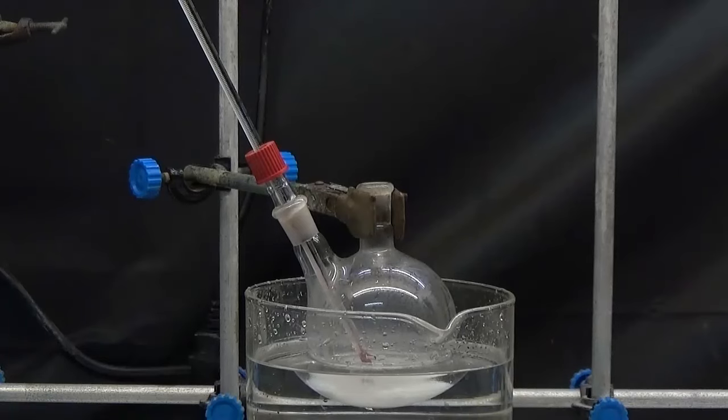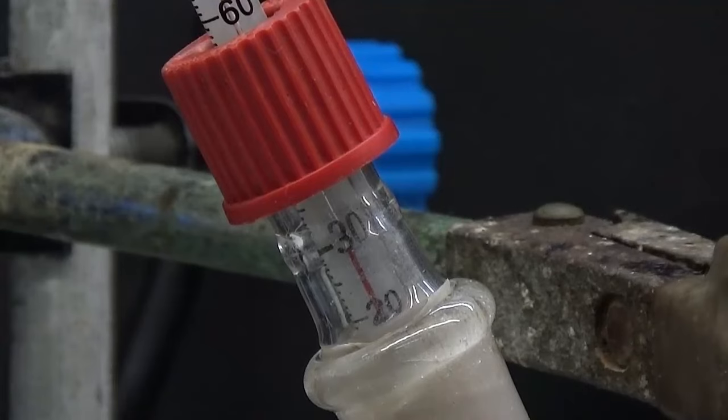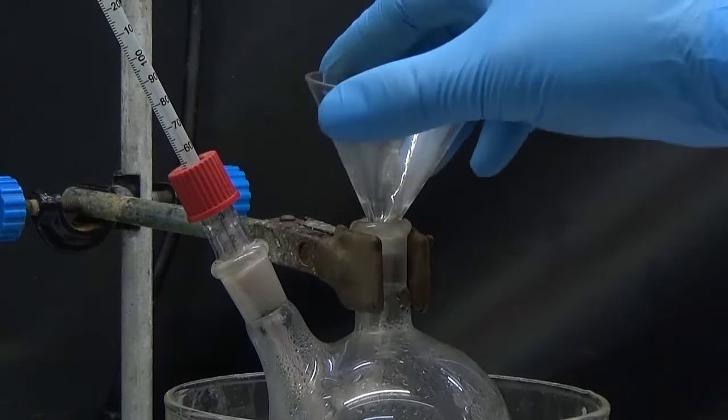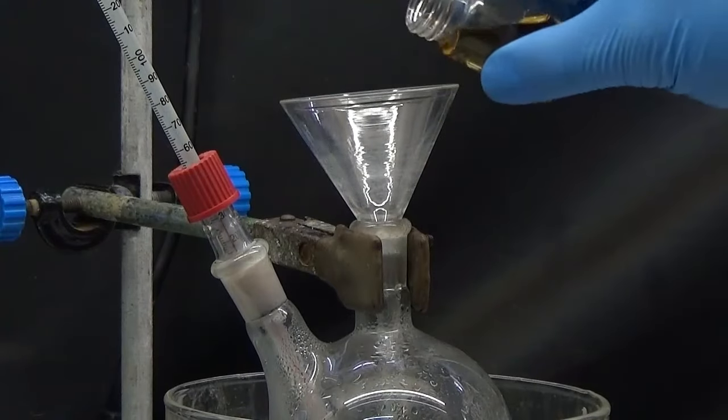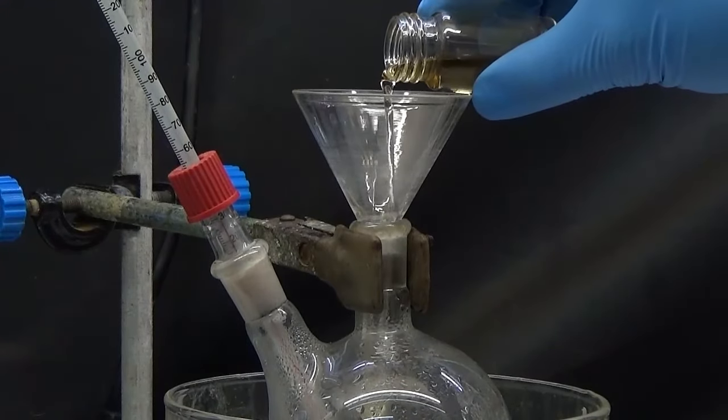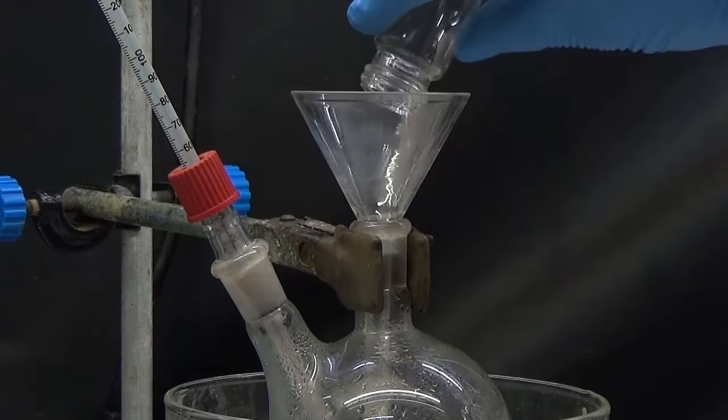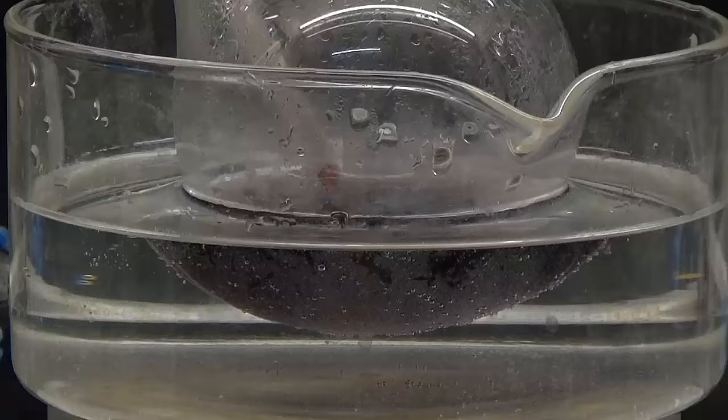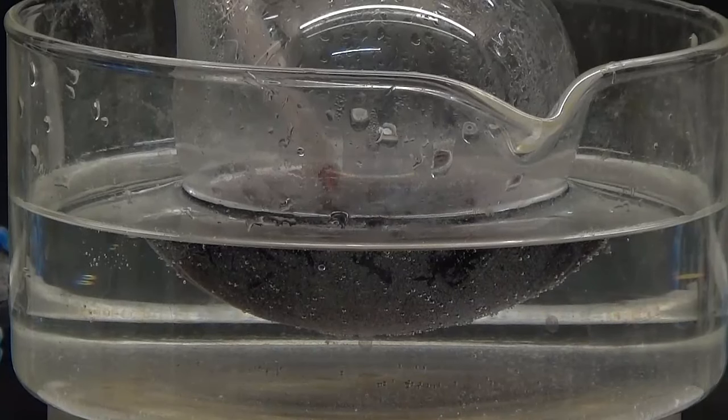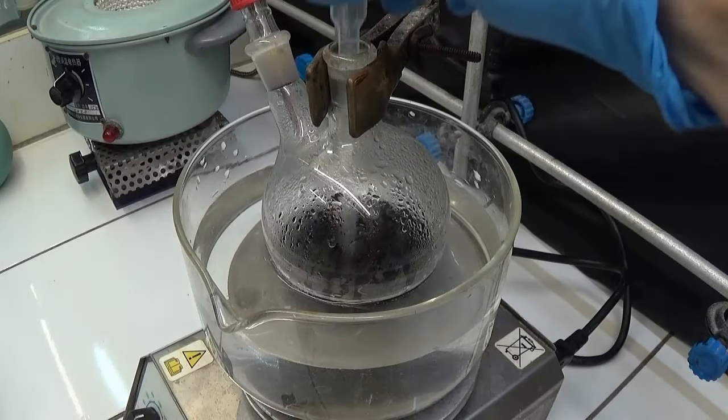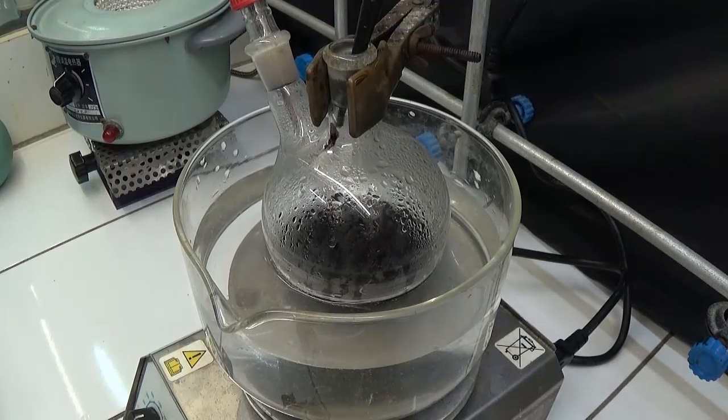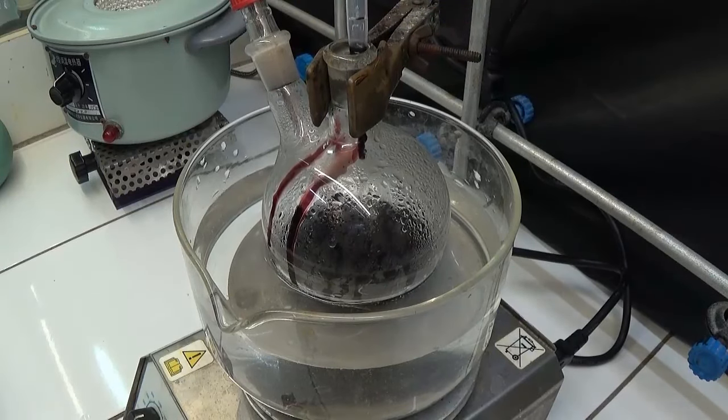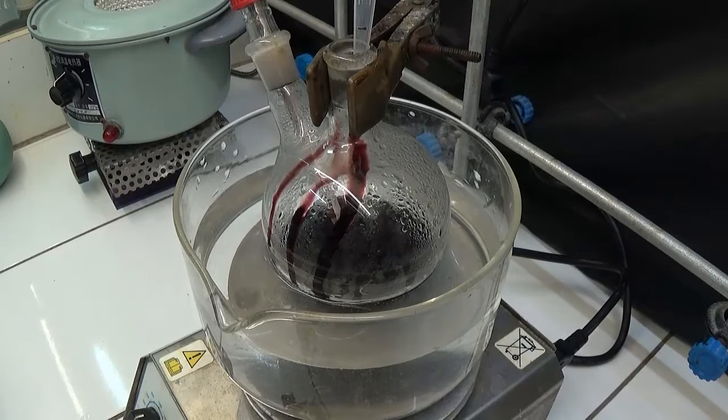Heat gently until all solids dissolve with a hot water bath and cool to 30 degrees Celsius. Add 16.4 grams of furfuryl alcohol and wait until the temperature rises. Do not allow the temperature to exceed 60 degrees. Keep the ice and water bath nearby if the reaction gets violent. With addition of furfuryl alcohol, it turns red. The temperature is only 50 degrees.